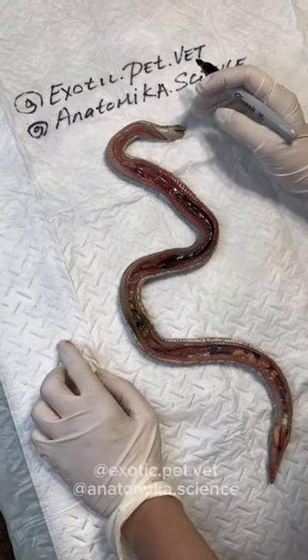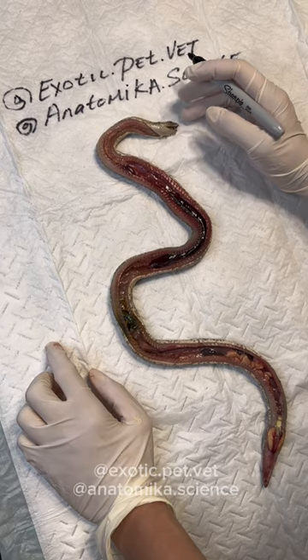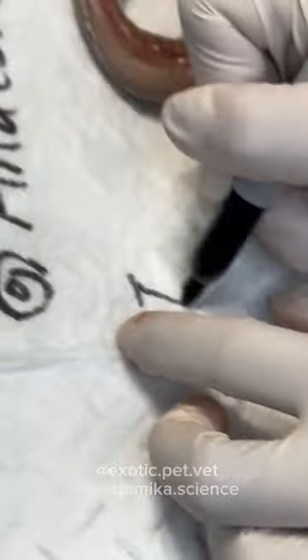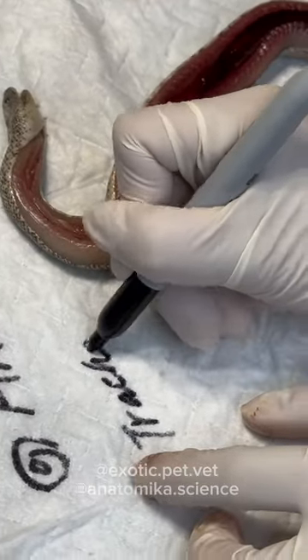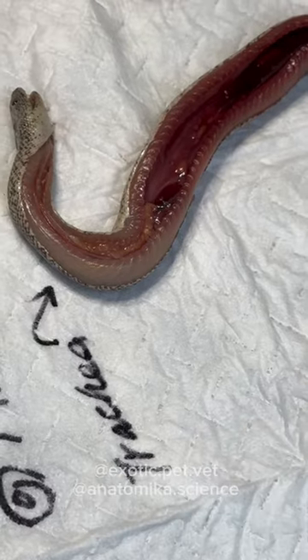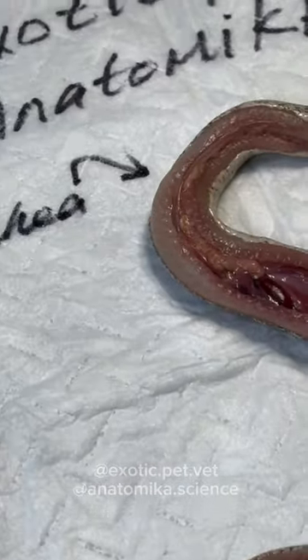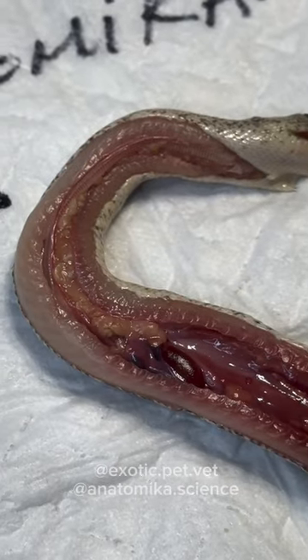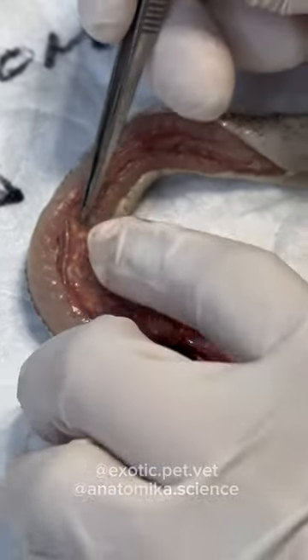These guys have a lot of structures that are similar to us. Here you see the trachea, and on the other side is the esophagus.